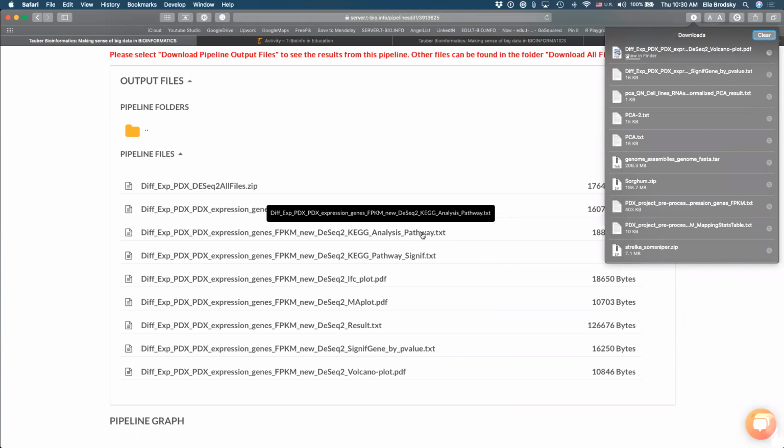Okay, so unfortunately we ran out of time, but I hope that this gave you a little bit of an insight into how to do exploratory data analysis, so understanding statistical properties, comparing different samples and different genes, and then understanding the biological interpretation. What does this actually mean when we find differentially expressed genes, and what is their biological significance? So to speak about the specifics of how do you apply this in the context of a project, we will talk about it next time to discuss different project examples that you can use to really understand how this all works together. Now, before we leave, are there any quick questions?